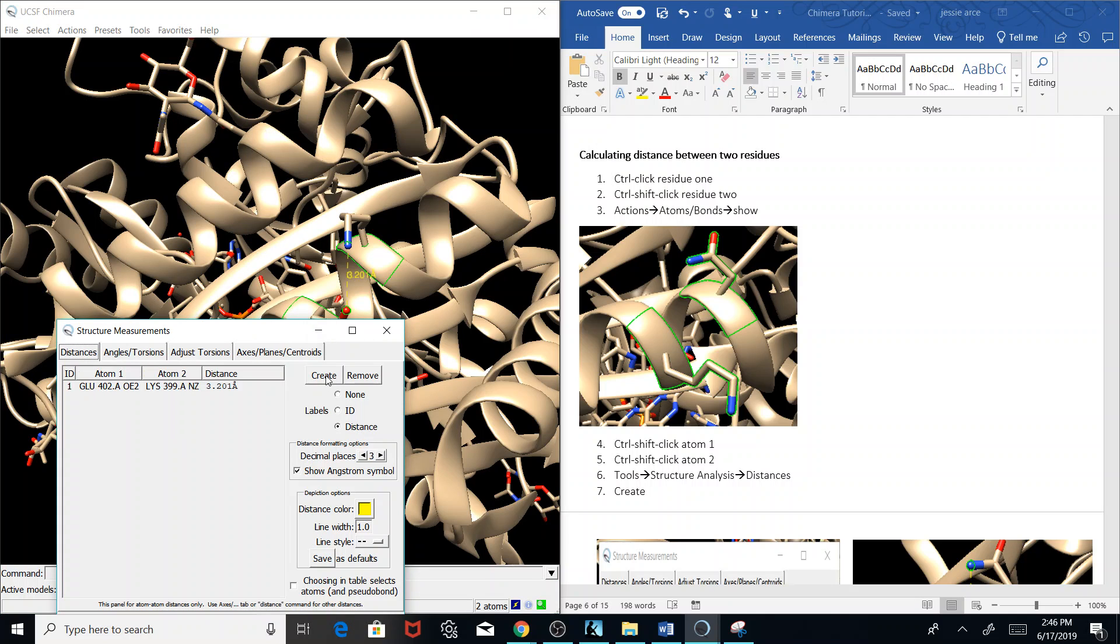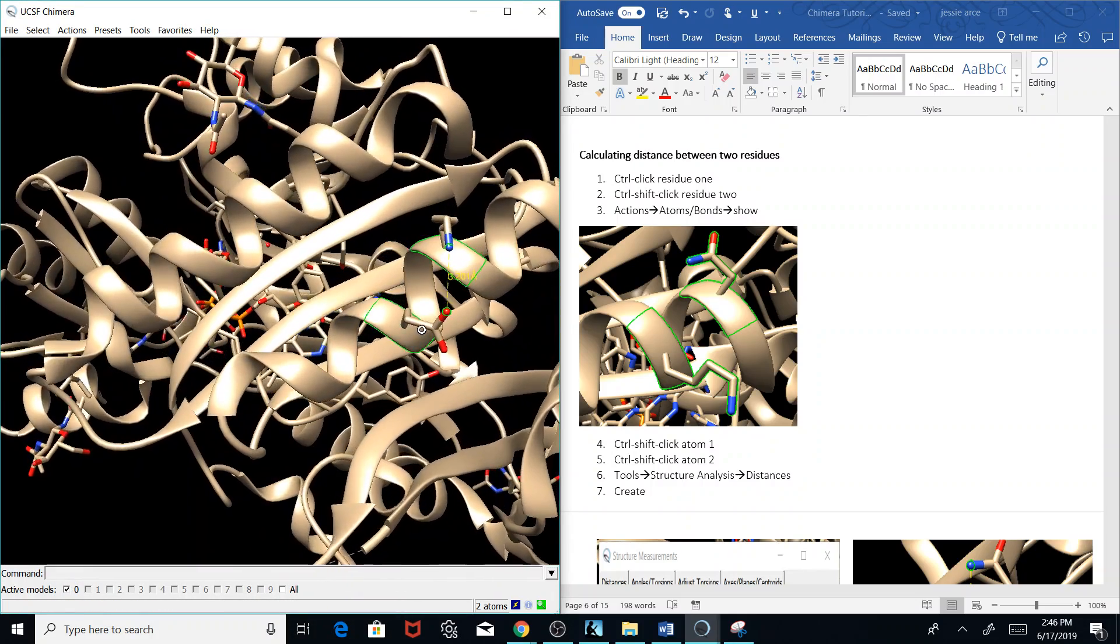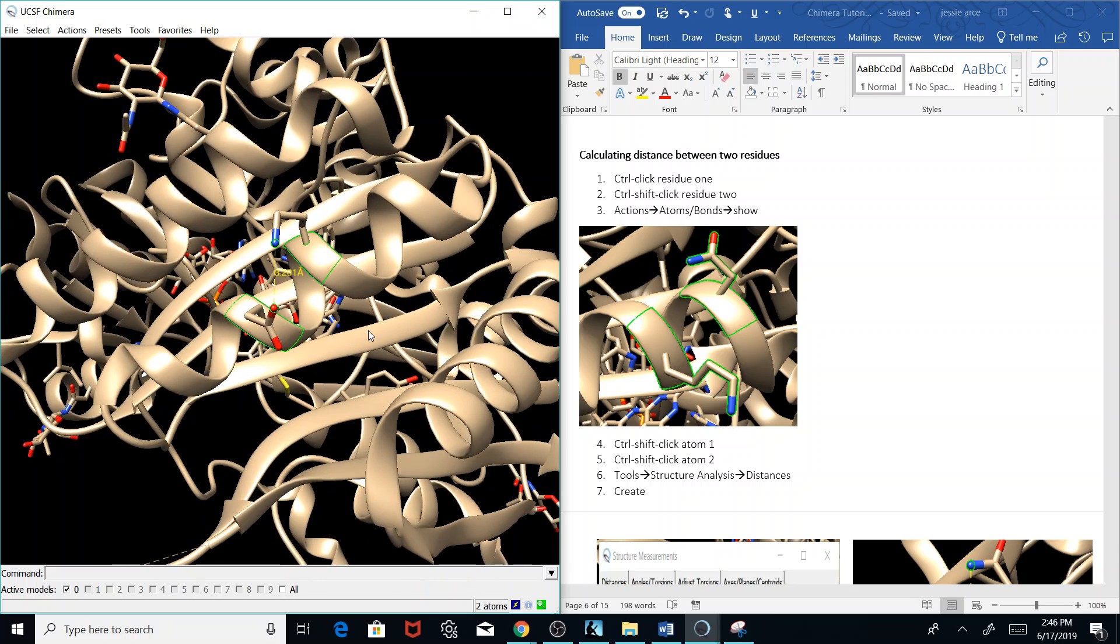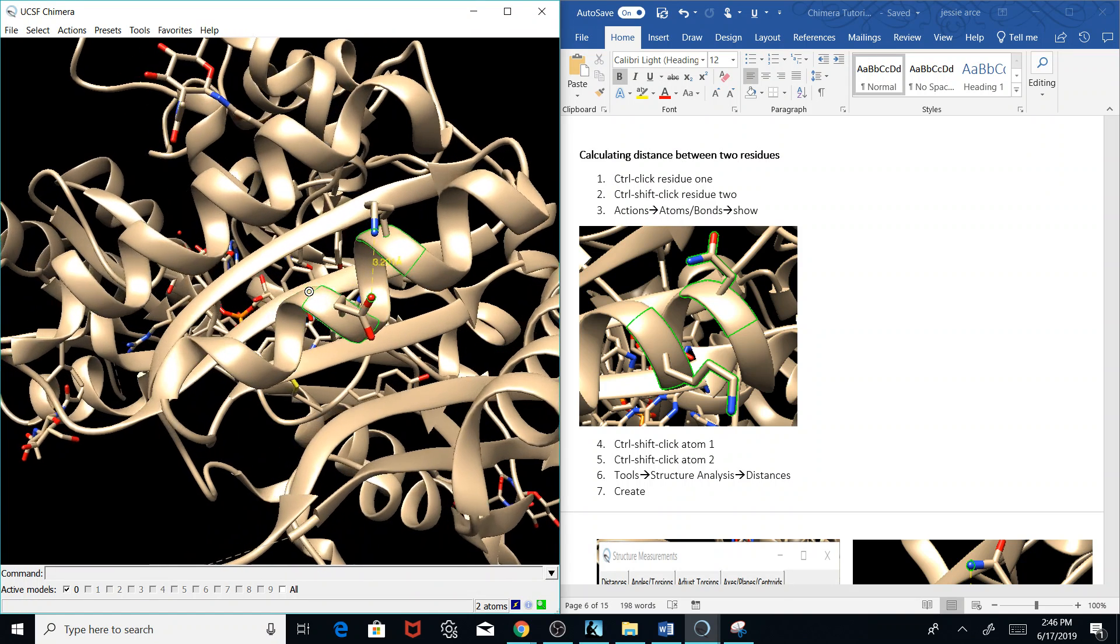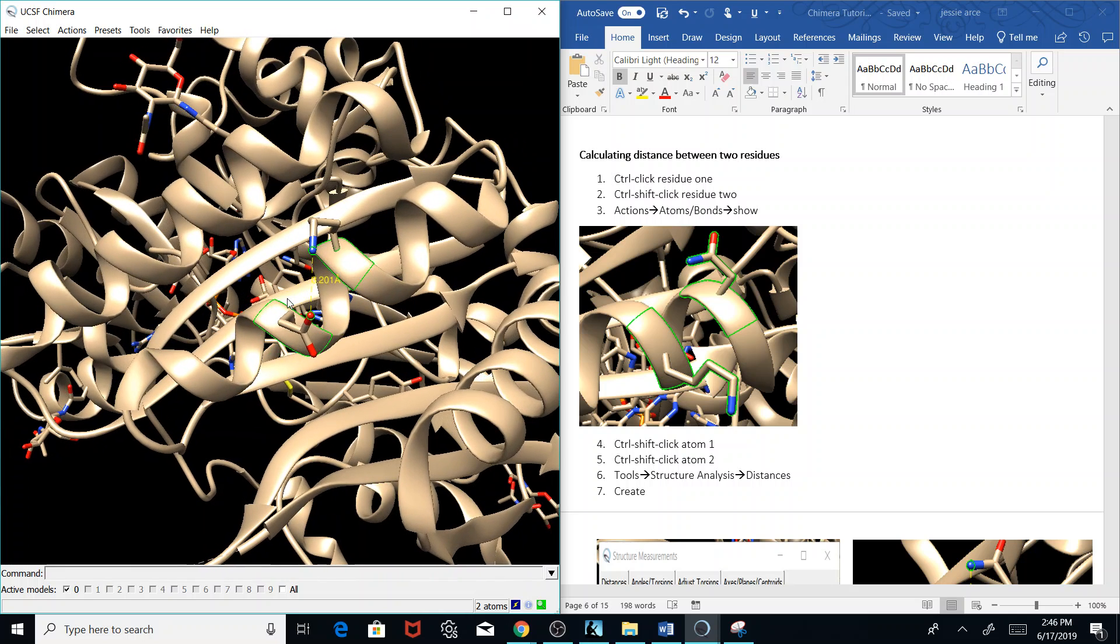Then I'm going to create, exit this out, and then here we have the distance between the residues right here, which is 3.201 angstroms.